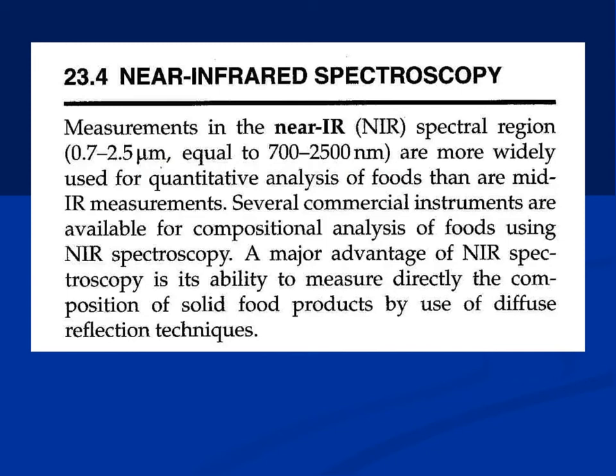Moisture, you just slide in. It's a very non-destructive technique. Of course, it's not a primary technique, but it's a secondary technique which has been standardized by these companies. So what happens is that you shine the NIR light. If I know that this food product has 10% moisture or 20% moisture, I slide it in and the light reflects in a certain way, and certain bonds, if water is present, will be absorbing IR radiation because of those vibrational transitions.